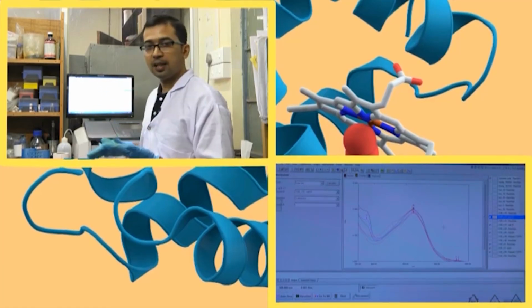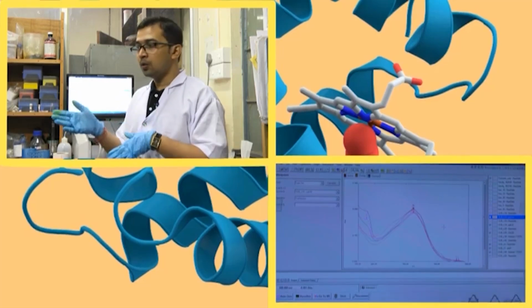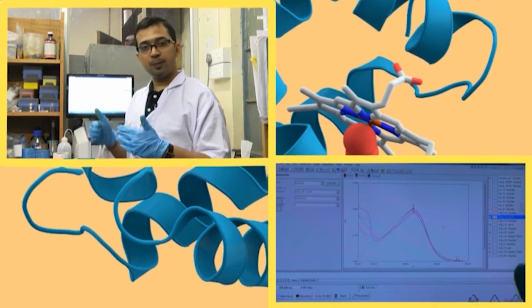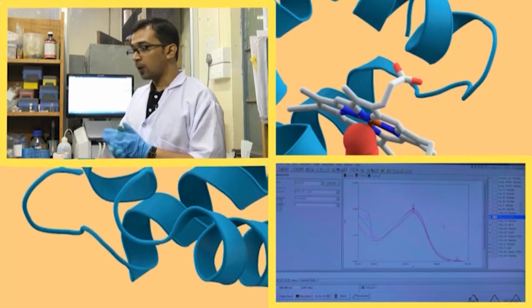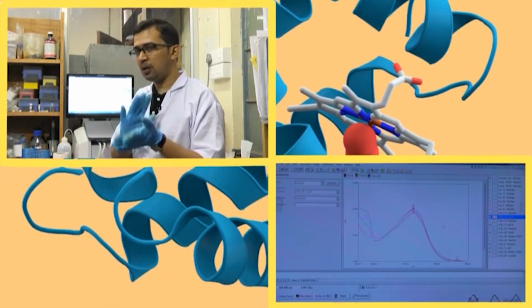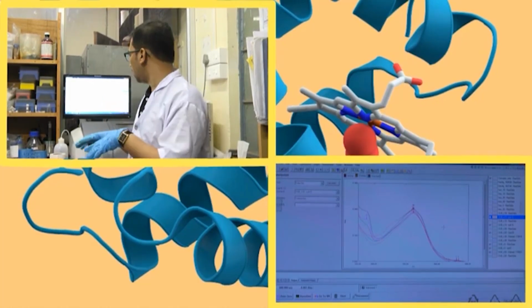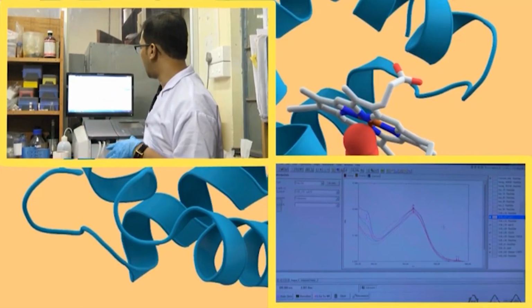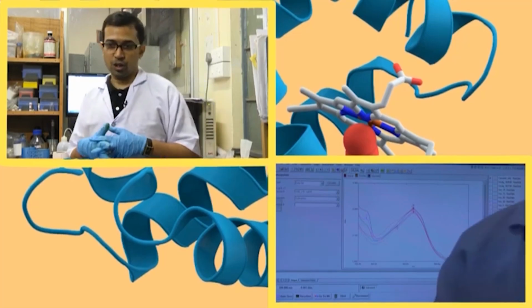Here we have seen that corresponding to the curcumin spectra at 420 nanometer, when you have added HSA it gradually decreases, okay, up to 10 microliter, 15 microliter, but again it increases. So, some anomalies might arise. There might be an anomaly or there might be logic, okay. I will say this to you a bit later. However, for calculation you can go to a region around 300 nanometer or this region which you feel is good enough for calculation.